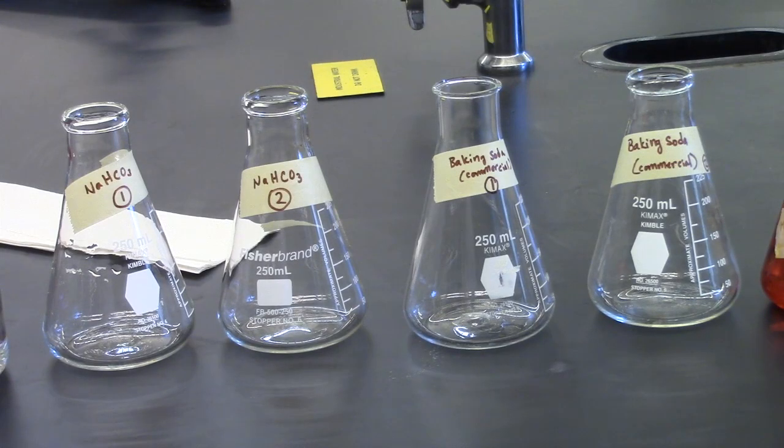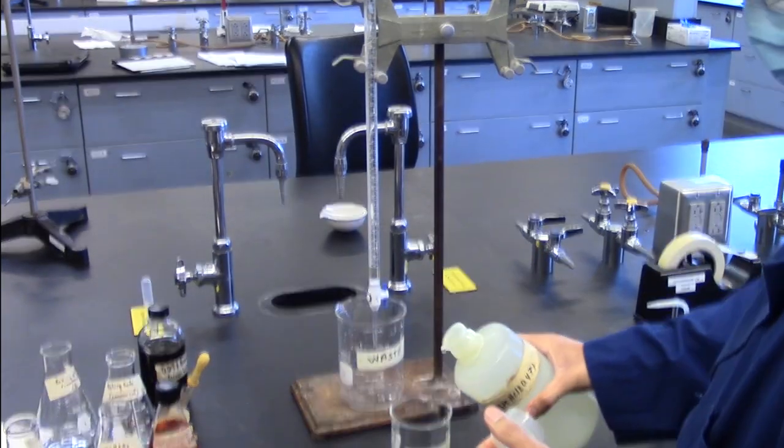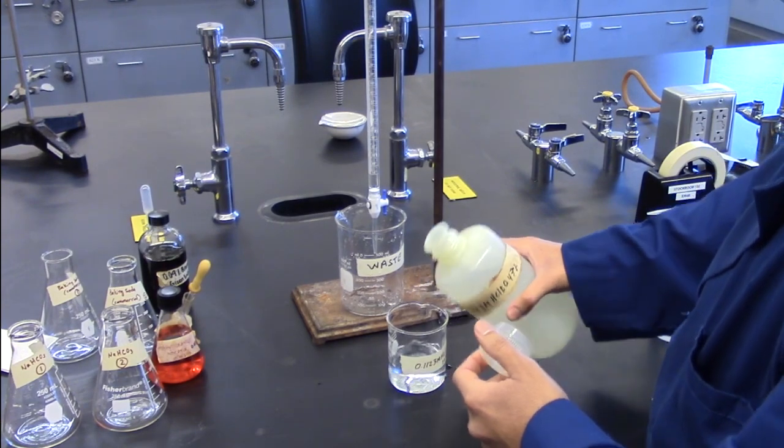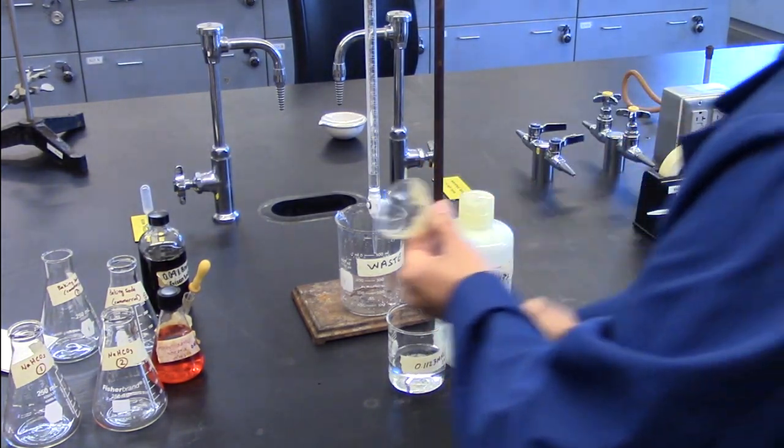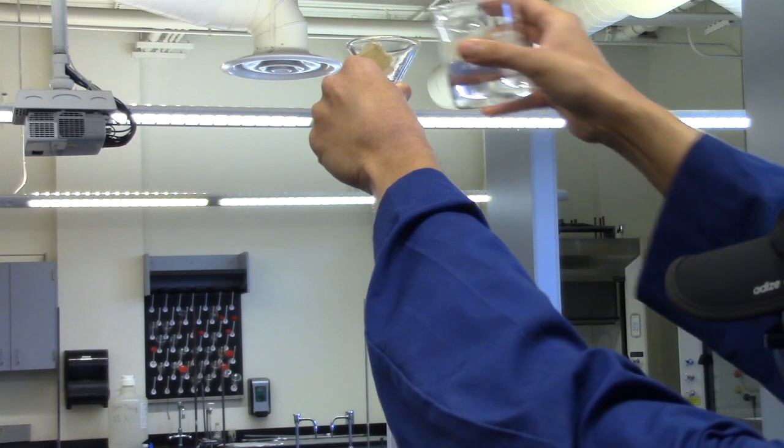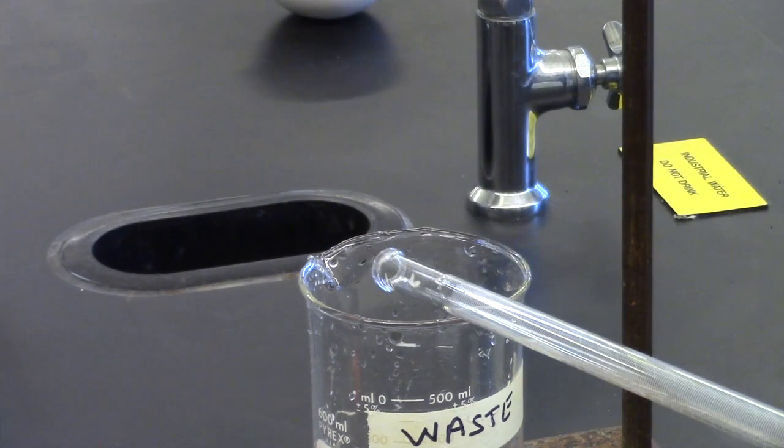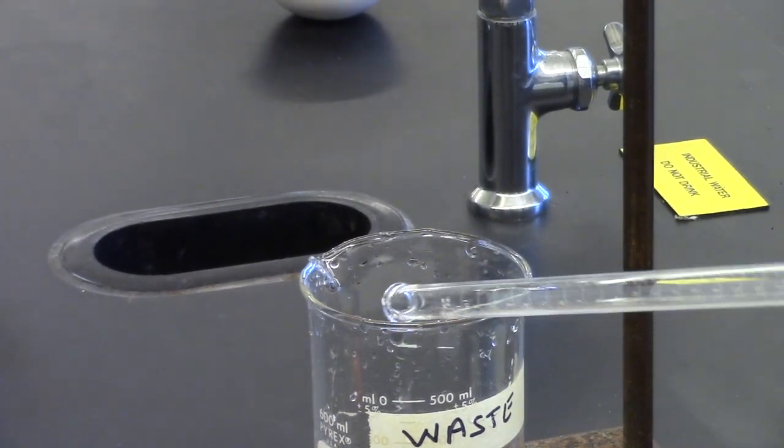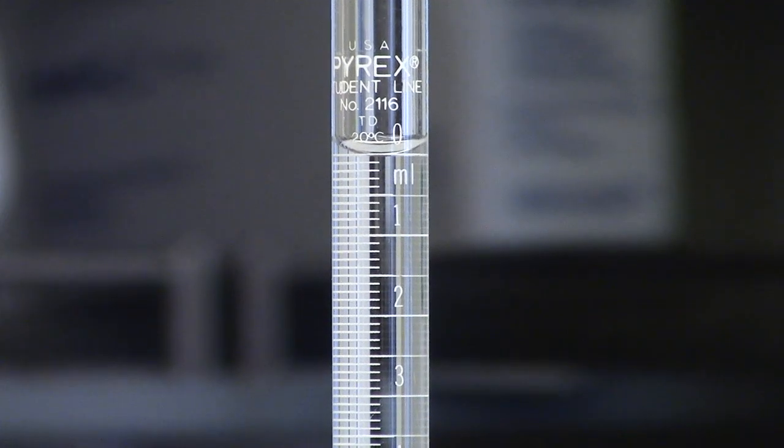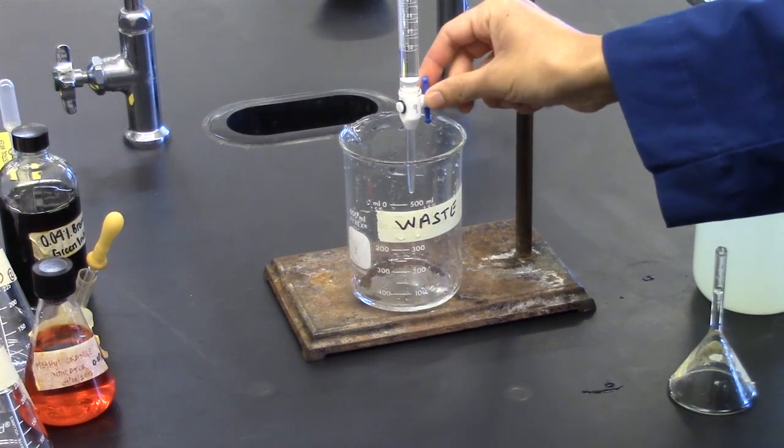You will need four 250 milliliter or 125 milliliter Erlenmeyer flasks, burette clamp, burette, ring stand, and a white background. In a clean 250 milliliter beaker, get about 120 milliliters of the standard hydrochloric acid solution and record the molarity. Rinse the burette twice with 5 ml portions of the standard hydrochloric acid solution. Fill the burette to the zero mark with a standard hydrochloric acid solution. Check tip of the burette for air bubbles.